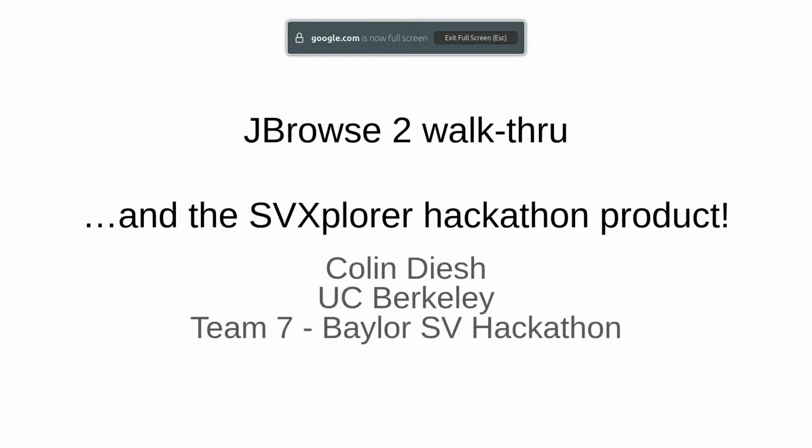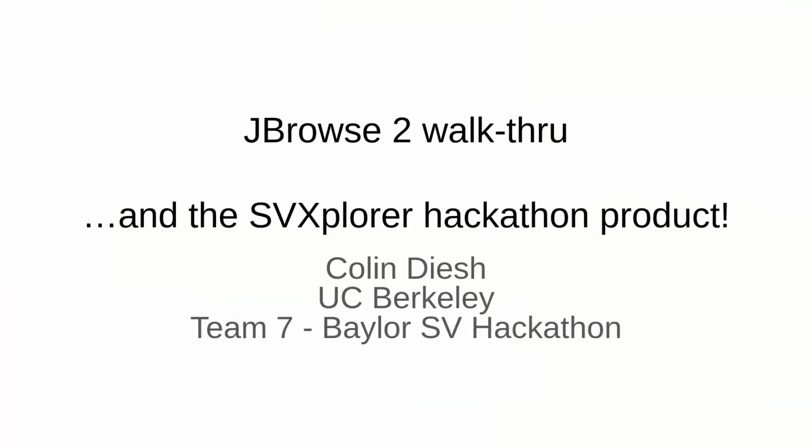Hello everyone. I'm going to give a walkthrough of some JBrowse 2 functionality and show how we connected it to the hackathon project with SV Explorer. This is a re-recording of the Zoom call I gave, but hopefully it captures the same amount of content.